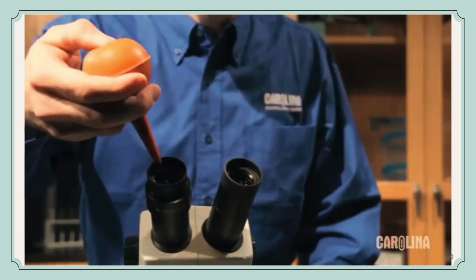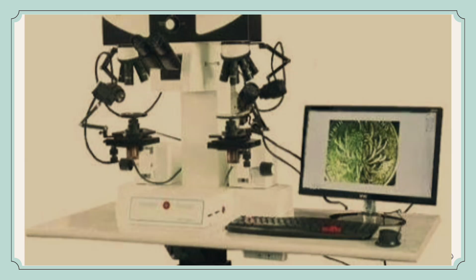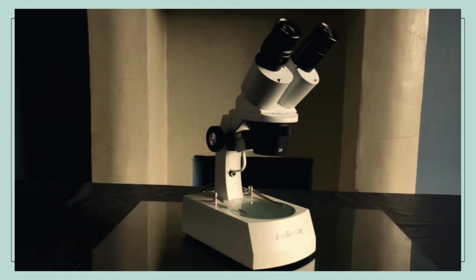Each instrument plays a unique role, from recovering bullets safely, to magnifying and comparing markings, to measuring dimensions with precision. Together, they allow forensic examiners to identify firearm signatures, analyze firearm characteristics, and accurately determine whether a particular weapon was used in a crime.